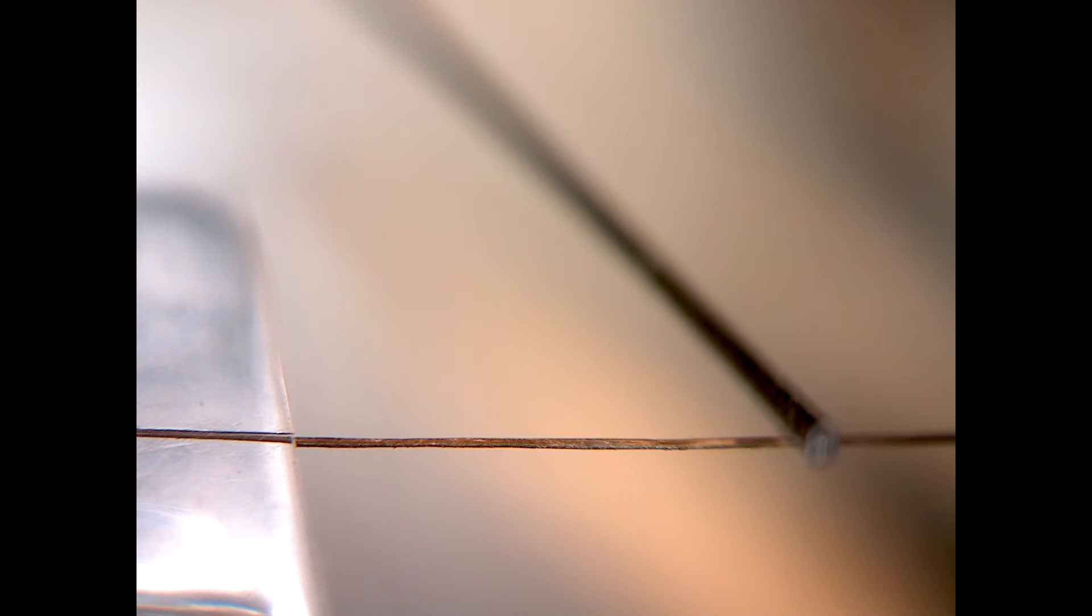We can do a similar test using the micro scale system on a human hair. In this case the displacement is about 0.2 millimeters and the peak load is about 30 micronewtons so only about one millionth the load used to bend the popsicle stick.